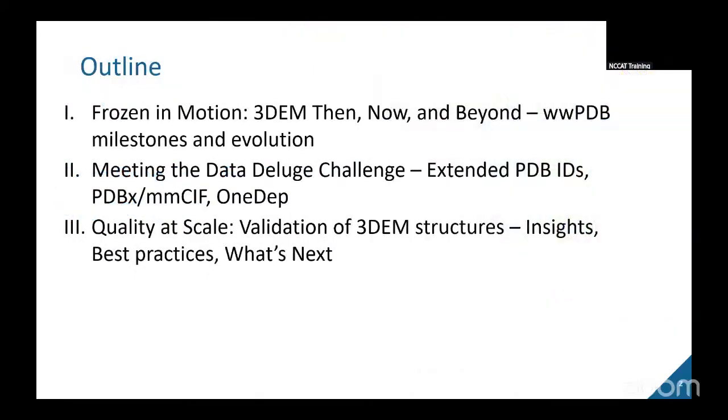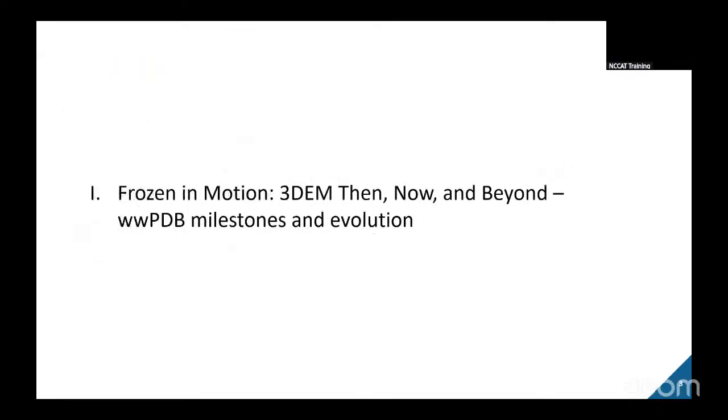We're going to cover a lot in this hour, so I think first it's good that we understand how the archiving systems and standards that we use today were developed. We'll then switch to how we can keep up with rapid growth in the field. And then finally, I will speak on the topic of validation. If you do have questions or if you want something clarified, just go ahead and speak up, and I'll help you. Let's go ahead and start with the big picture. We'll think about the roles that we all play in developing the archiving systems and standards that support them.